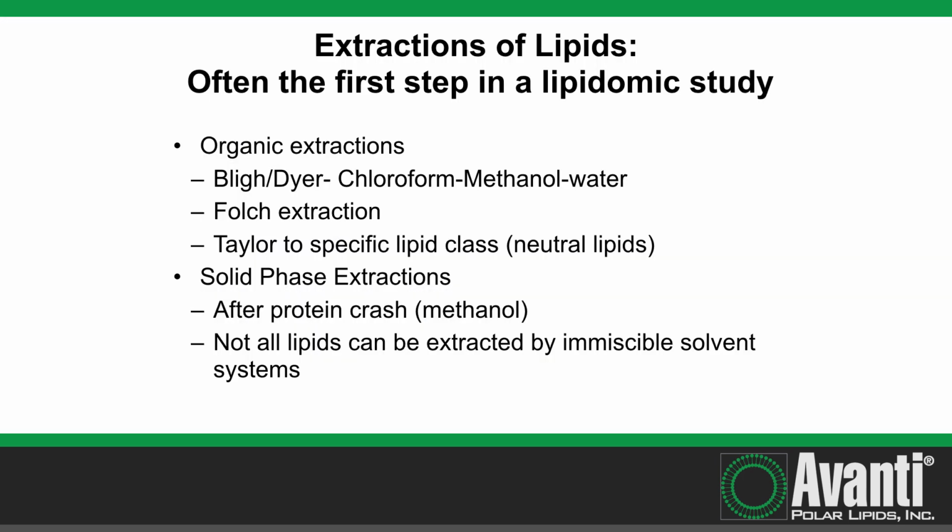So solvents are an important part of lipidomic studies. They're typically the very first step, as you saw in my introductory video of a lipidomic study. They're not limited to just chloroform, methanol, water extractions like were described by Bligh and Dyer or Jordi Folch. And very often one can tailor your organic extraction to actually optimize the yield of a certain class of lipids and at the same time minimize isolation of an interfering class of lipids which you are not interested in studying and therefore just become problematic to you.